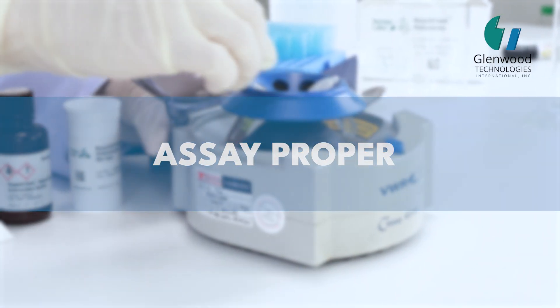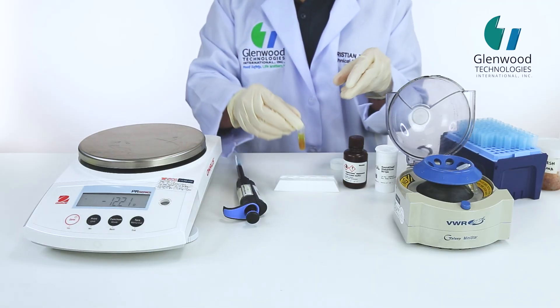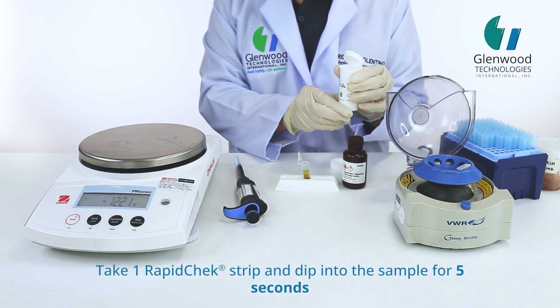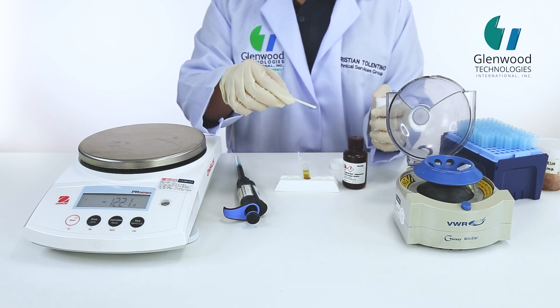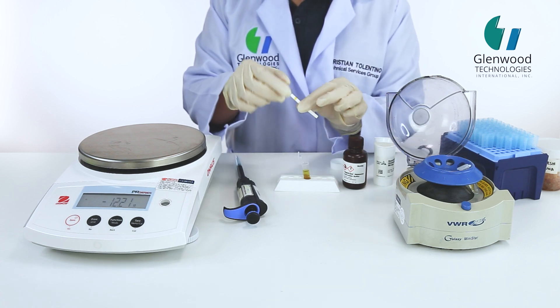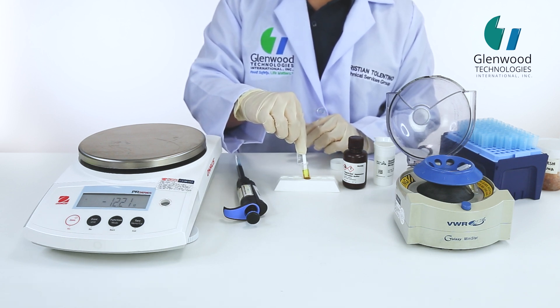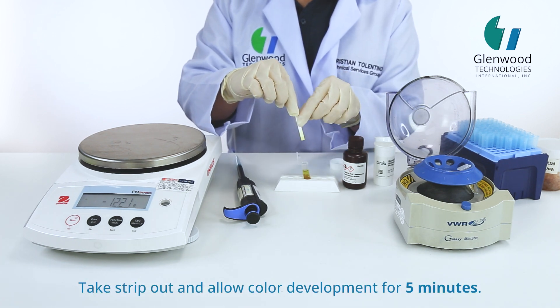Assay proper. Take 1 Rapid Check Strip and dip into the sample for 5 seconds. Take strip out and allow color development for 5 minutes.